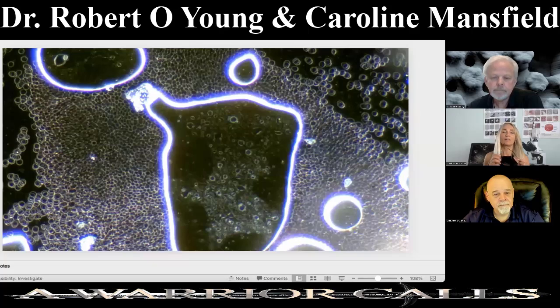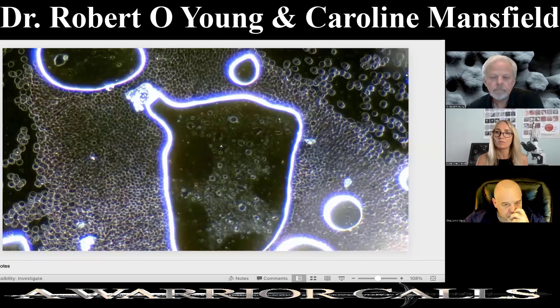Okay, so just looking at blood, for example, which I think a lot of us are familiar with, these hydrogel, what we're calling construction sites, made of polymers, possibly. As a Darkfield microscopist, again, I can't say what they are or aren't made of because I don't have the correct microscope to make that assumption. But there are people out there who have done that, such as Dr. Young, who does have the correct microscope with spectrometry to name substances within structures that we're looking at.